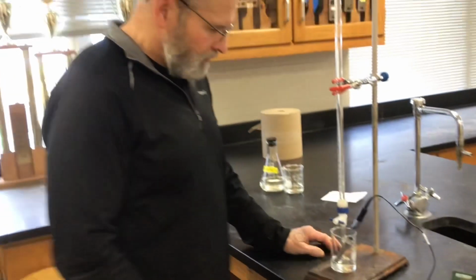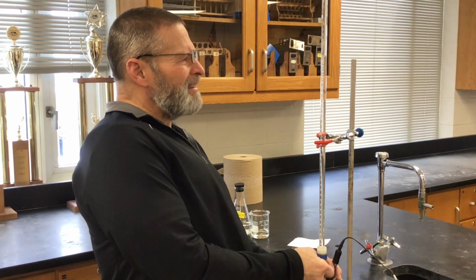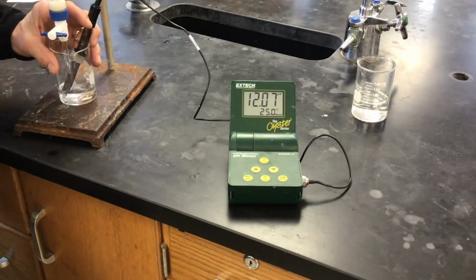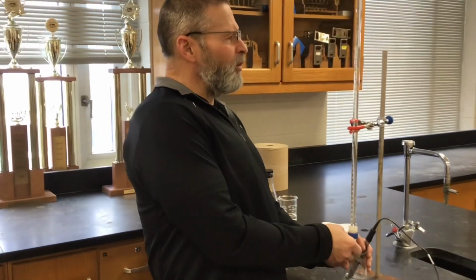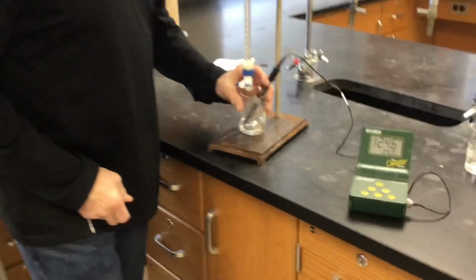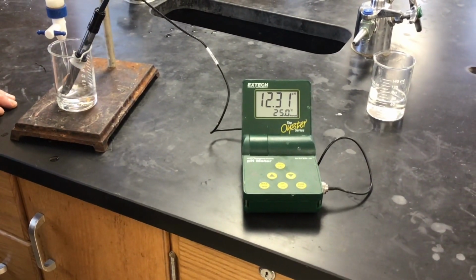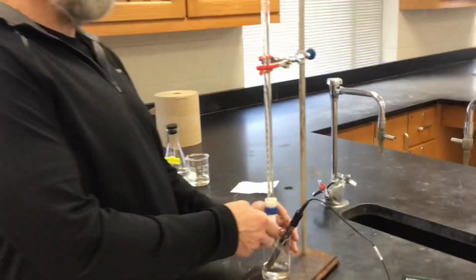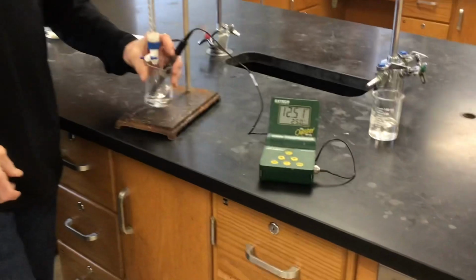All right. I'll go another half just to get to an even. Okay, so there's 13 added. Okay. All right, now I'll go a full one. There's 14 added. And one more to finish us off? One more, why not? Okay, there's 15 milliliters added.